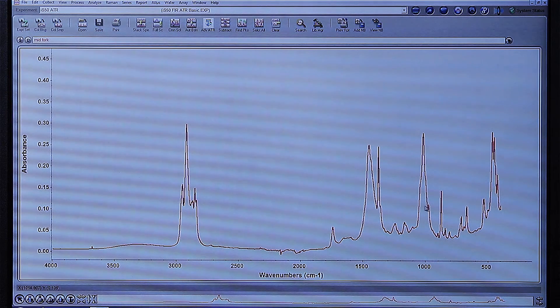This is the spectrum from our sample, which happened to be a biodegradable or compostable fork. We can see we have several peaks that we might look at, but we notice over in the far-infrared region, we don't have any data.